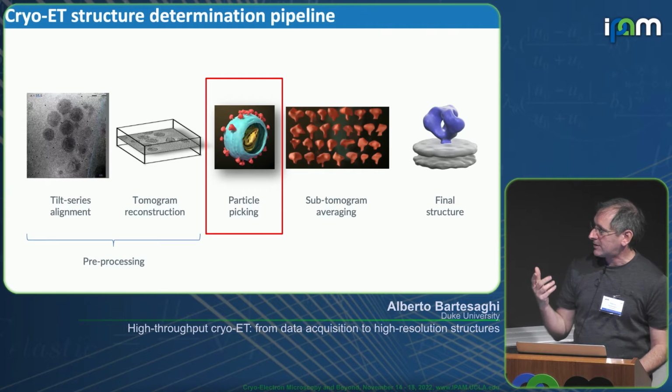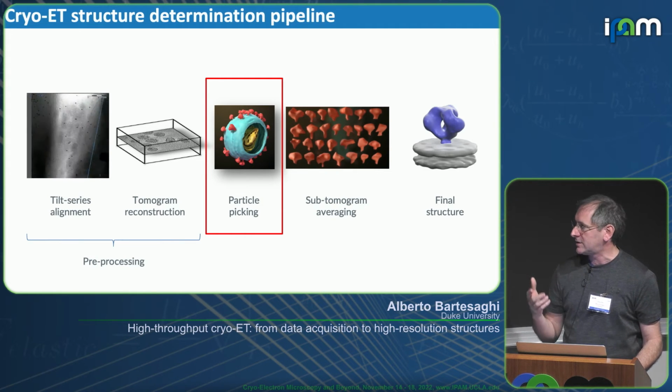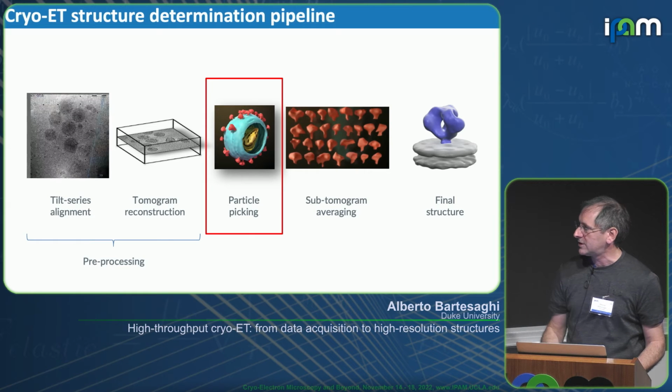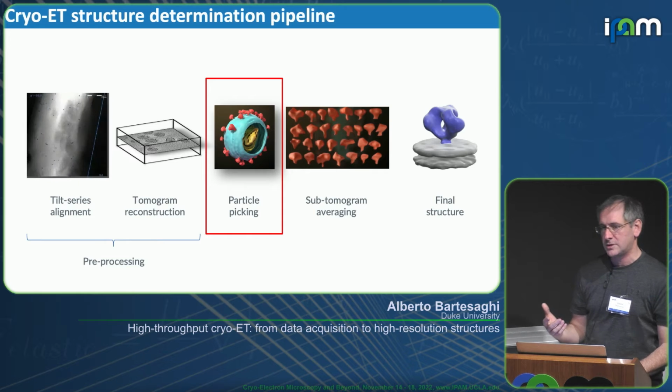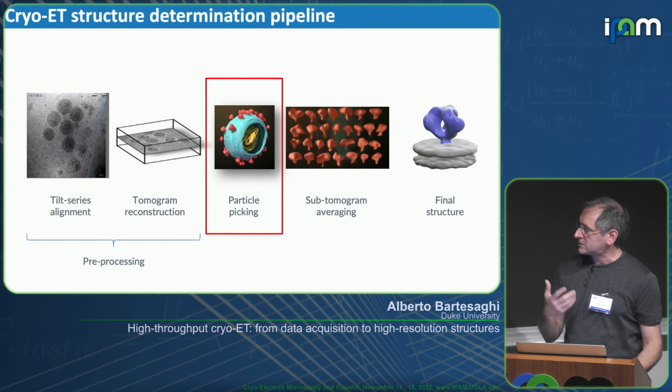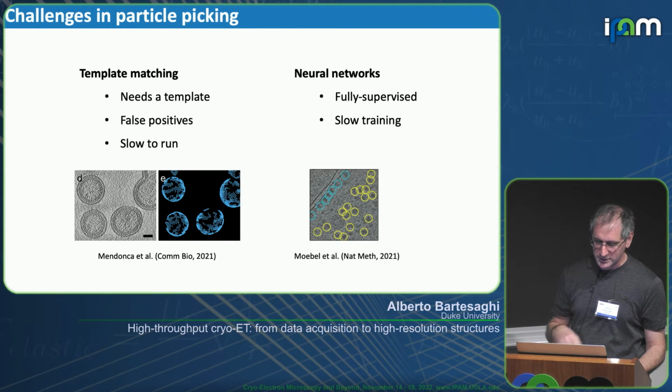I'm going to tell you a little bit about our efforts in trying to make particle picking a little bit more automated, or more consistent with high throughput data collection. There are many efforts in this community trying to tackle that because there are a lot of solutions out there, but there is also still a lot of room for improvement.